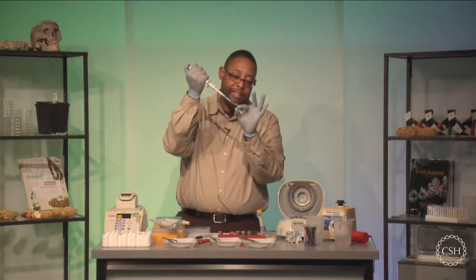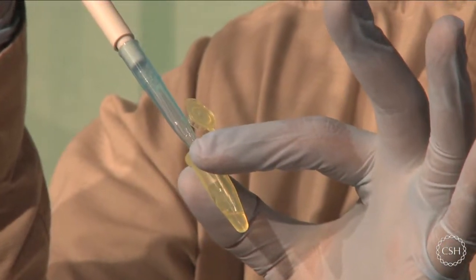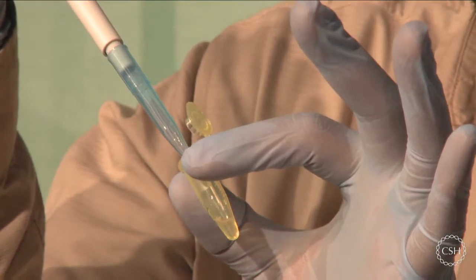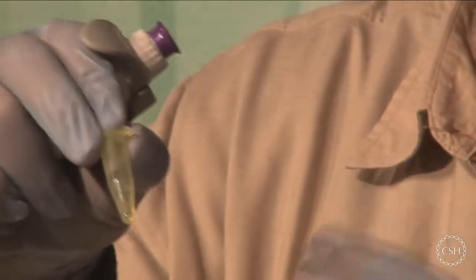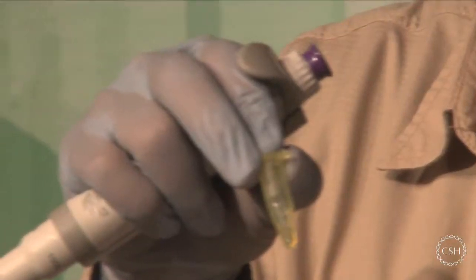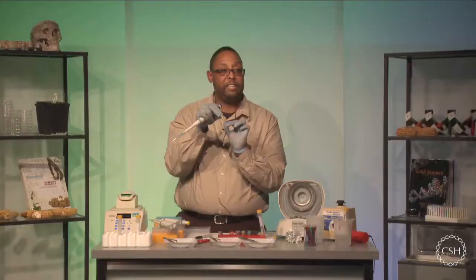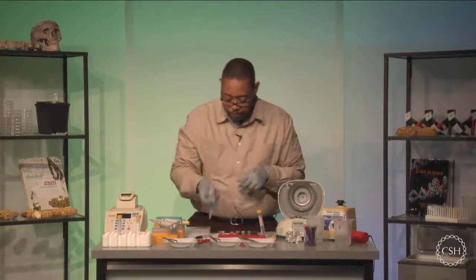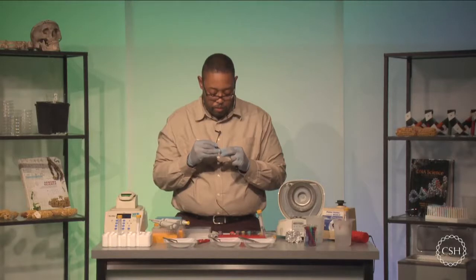So what I'm going to do here is not touch the inside of the test tube with my tip. I'm just going to release the contents of my tip into the test tube here, and then work my way out of there. So what I did is I minimized the exposure of the material that was on the outside of my tip to my test tube and only deliver the clear lysate, or the liquid. Let me get rid of this. And of course, I've got to label my sample. This is going to be S2.